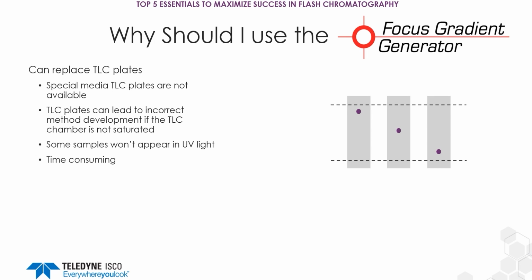Another reason why you might not want to use TLC is a lot of the time our TLC techniques aren't up to par. We're not saturating the chamber. My colleague Jack Silver actually wrote a great paper about this titled "Let Us Teach Proper Thin Layer Chromatography Technique." So if you're still interested in using TLC as part of your method development, I'd recommend Google searching that title. You can find it on the ACS website and make sure you give it a read. We can give Jack a couple more clicks, which I know he'll appreciate.